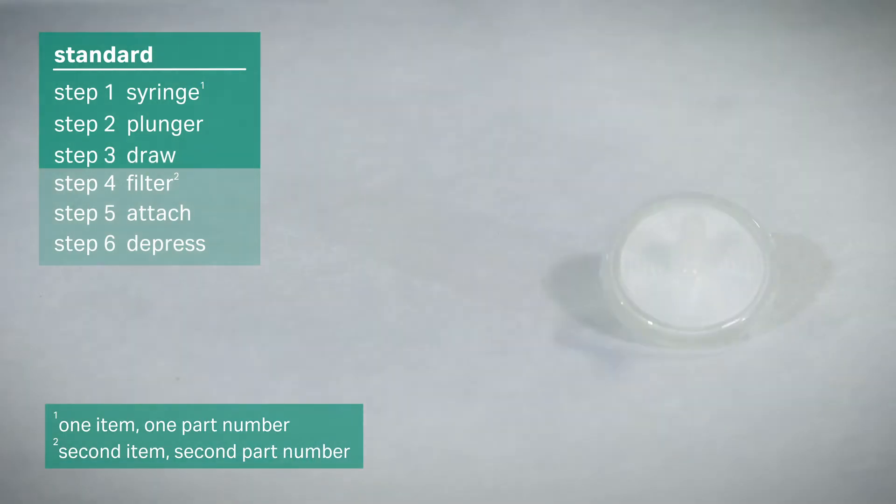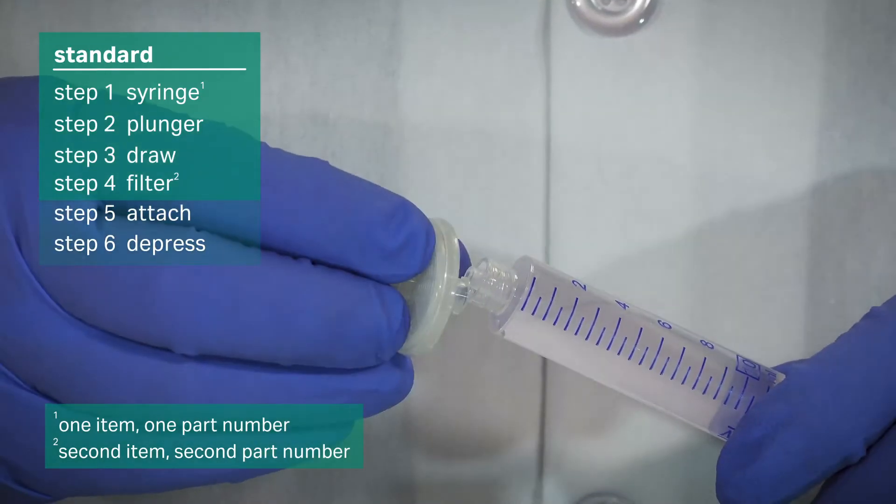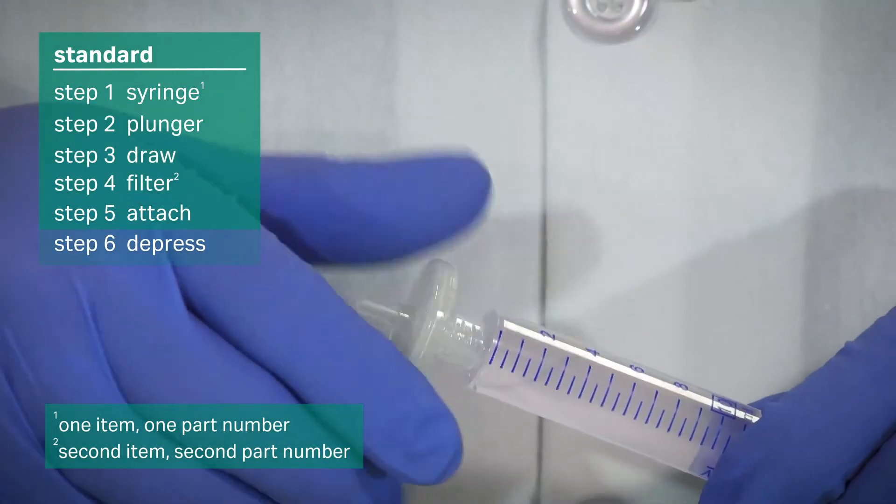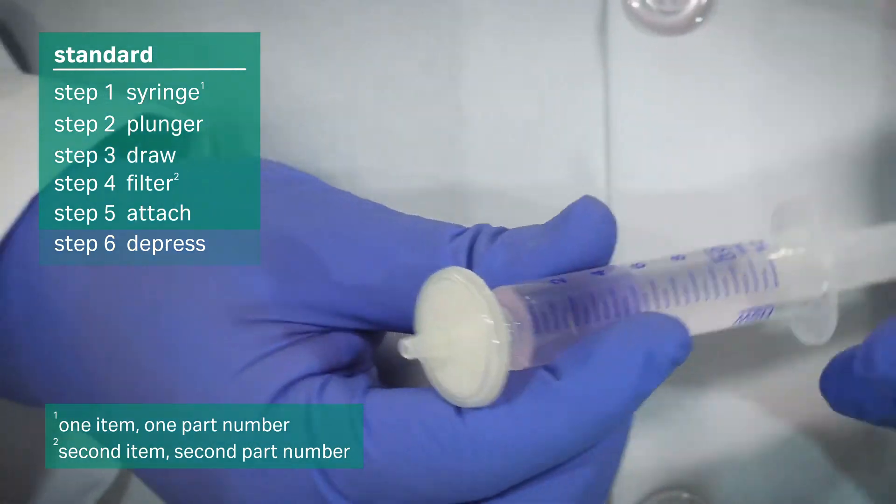Now retrieve the syringe filter and place it onto the syringe by using the slip luer fitting or luer lock on the end of the syringe.